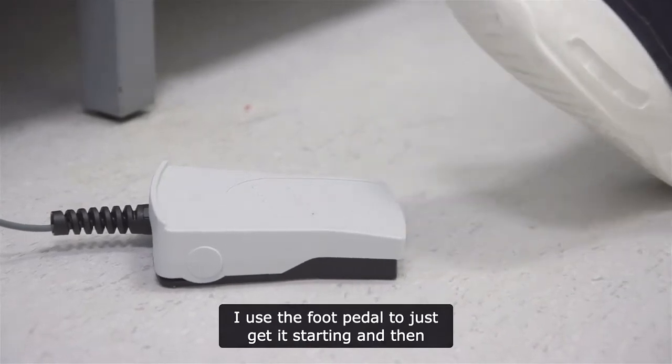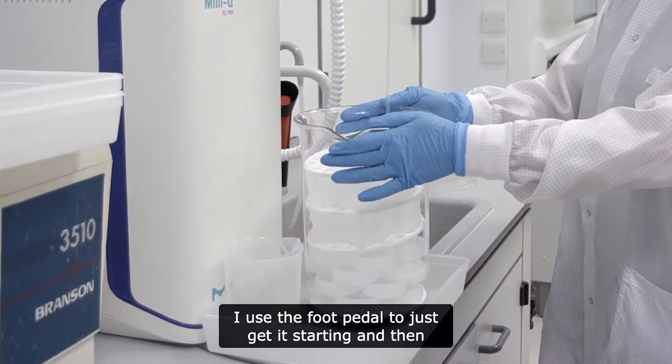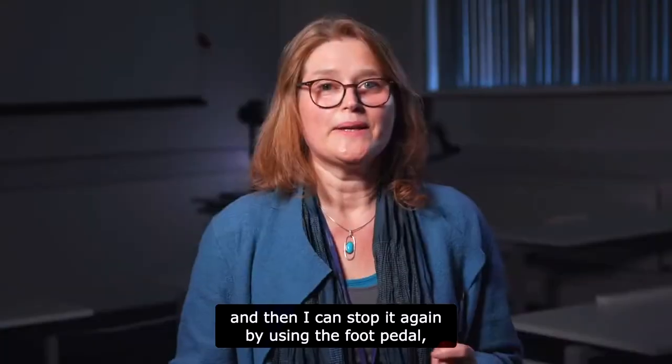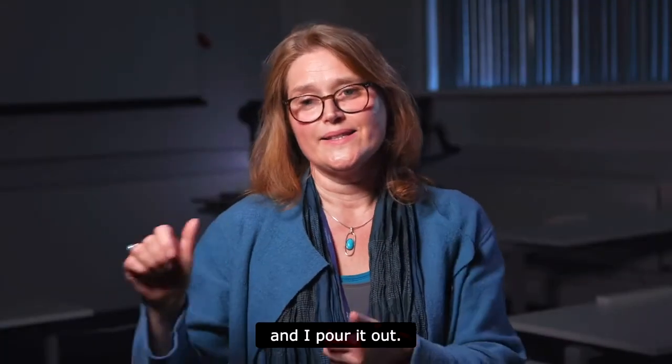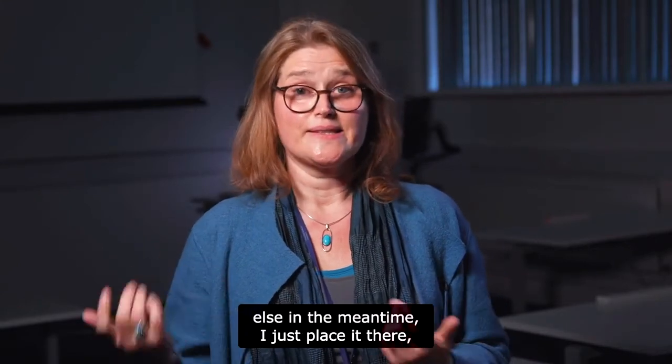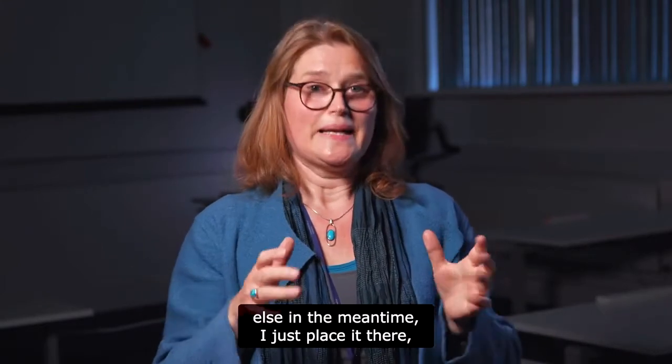I use the foot pedal to get it started, then I let it run until it's done, and I can stop it again by using the foot pedal and pour it out.